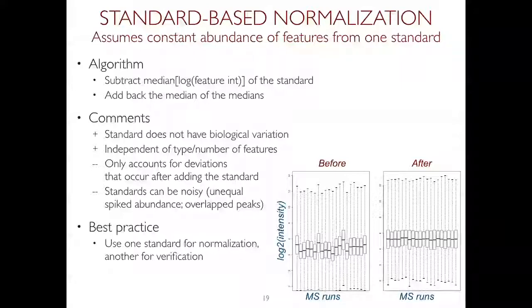Can you remove true biological variation? Sure, you can remove some real interesting proteins this way, but at least you spared money and didn't run these extra experiments before. You can also remove features which have a very low CV, because it's probably because they're reaching saturation and they don't vary enough. You can remove things for other reasons too. For example, I identify a protein and I don't know what to make of it, I cannot follow up on it. I eliminate it upfront before even doing statistics, because it will not be useful to me. So any criteria you can use, provided that the same data are not used twice.